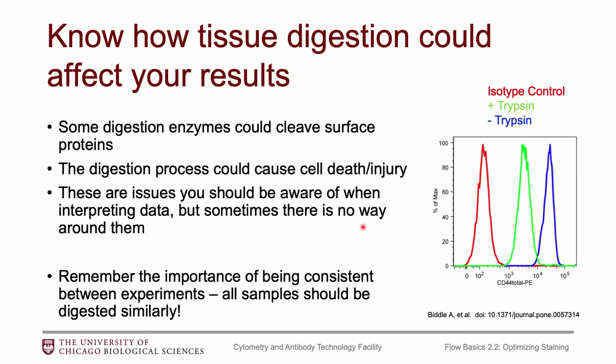There are a couple of factors you should be aware of. Some digestion enzymes could potentially cleave off your surface proteins, so you might be losing expression because of the enzyme you're using. Trypsin is a particularly bad one — you can see that when trypsin is added, CD44 decreases quite significantly on these cells. You may have to switch the enzyme, the concentration, or the time in the enzyme to address this.